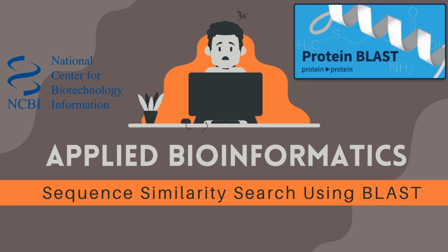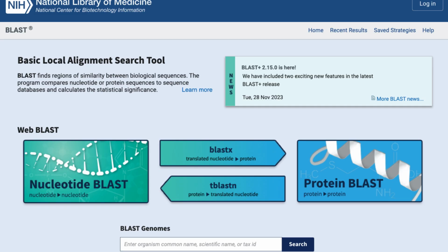Additionally, we will analyze homologous, orthologous and paralogous relationships. First, let's start with a brief introduction to BLAST.